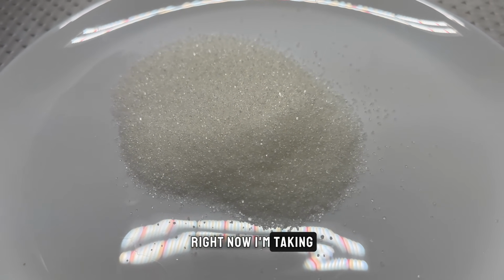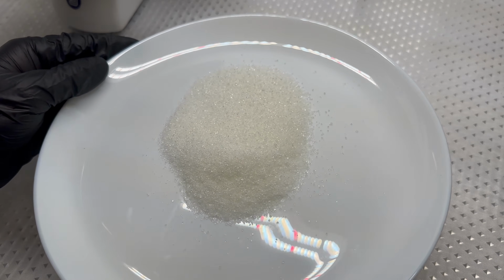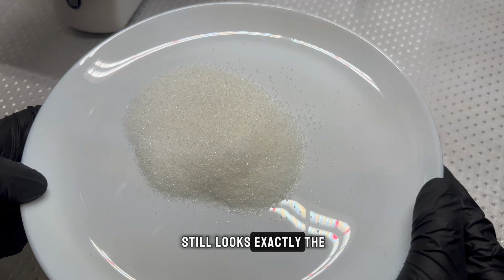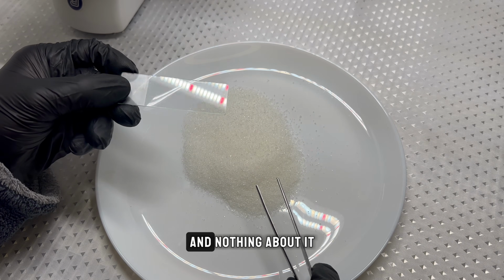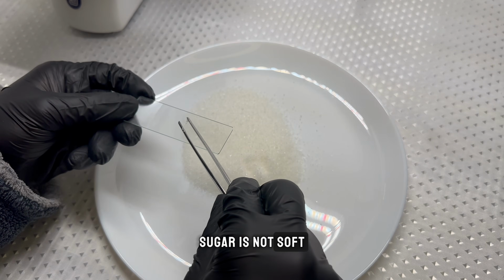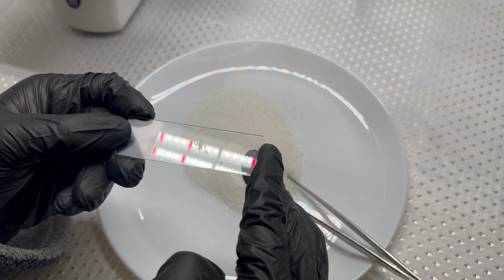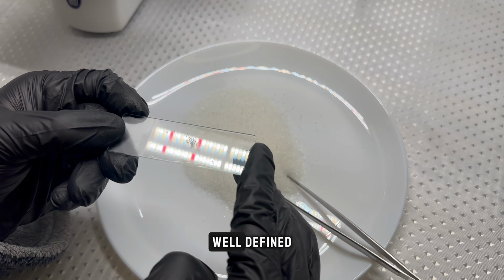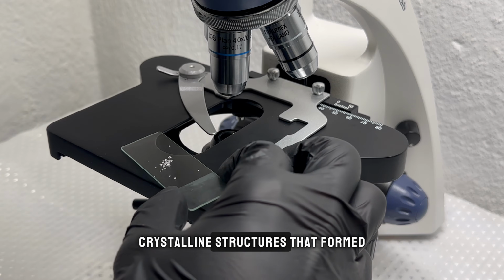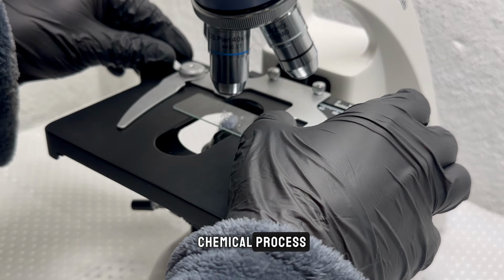Right now, I'm taking a small amount of sugar and placing it onto the microscope slide. At this stage, it still looks exactly the same as it always does, and nothing about it seems unusual. Sugar is not soft or smooth like it might seem in everyday use. It is actually made of rigid, well-defined crystalline structures that formed through a very ordered chemical process.